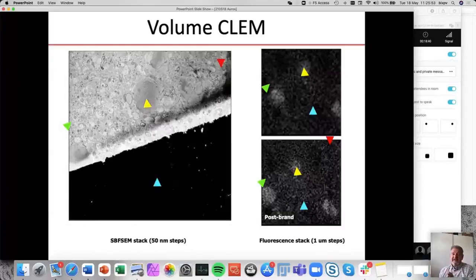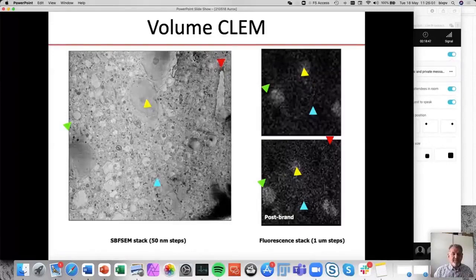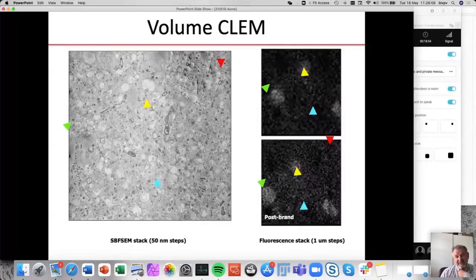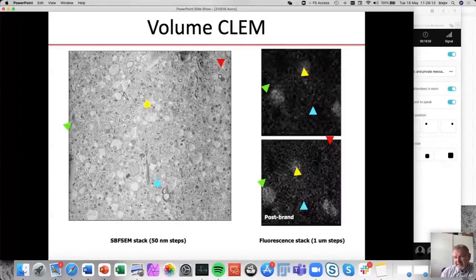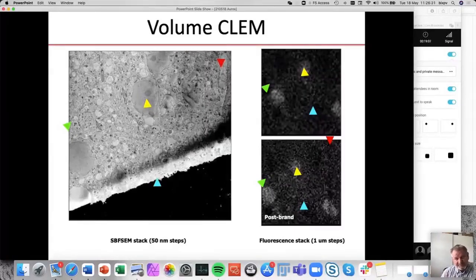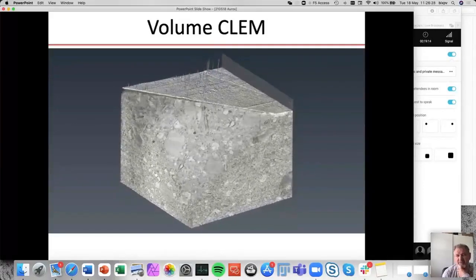And so we can see that in the light microscope, but now because we have such a large volume and we can do this large volume imaging with that scanning electron microscope, we can follow that neuron and look at it in high resolution. So we can much better look at connections between cells. So this serial block face SEM, as we call it, is used a lot in the connectomics field.